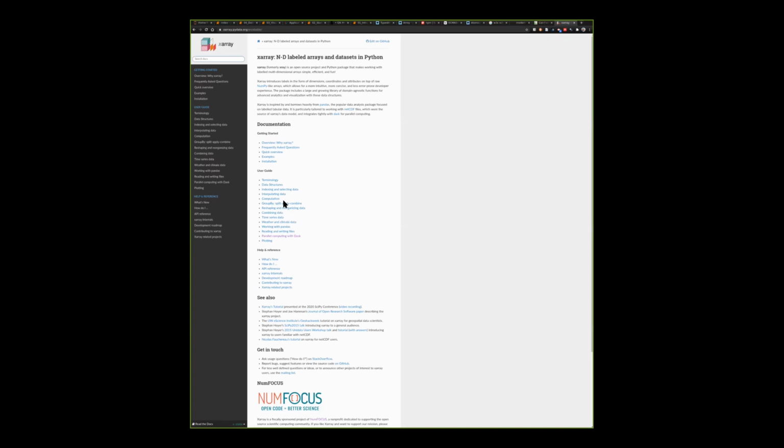If you're familiar with Python and NumPy, you have these n-dimensional NumPy arrays, but this adds metadata to that, particularly naming what the dimensions are, X, Y, Z, T, for example, time and the different spatial dimensions, and also metadata like what is the spacing between pixels, which is often different, and where is the origin of the image. So that adds that, and Xarray also supports serialization and deserialization from ZAR.